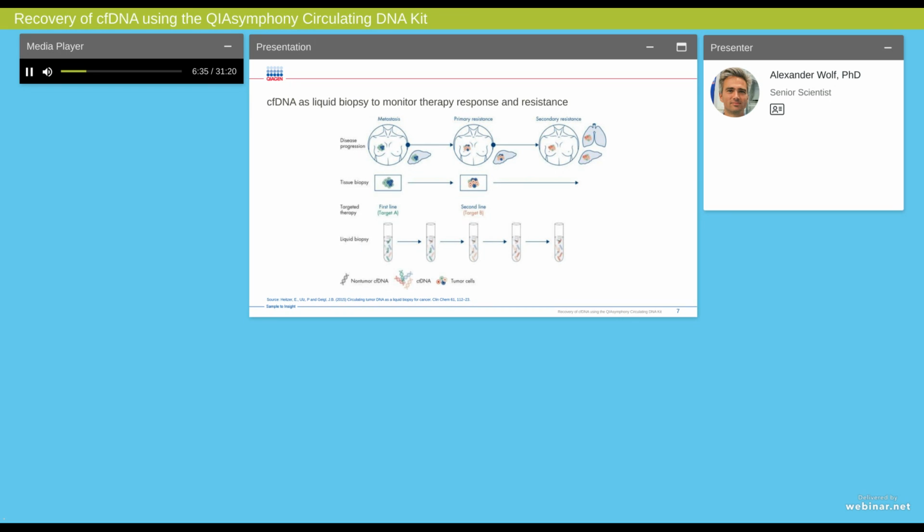This is indicated here in this figure by the richly colored circulating tumor DNA in the blood tube on the lower left side, which represents the complete heterogeneity of the tumor mutation. Few cell-free DNA molecules already comprising mutations responsible for primary and later on secondary resistance may be present in the first blood samples collected already at the beginning of a targeted therapy.